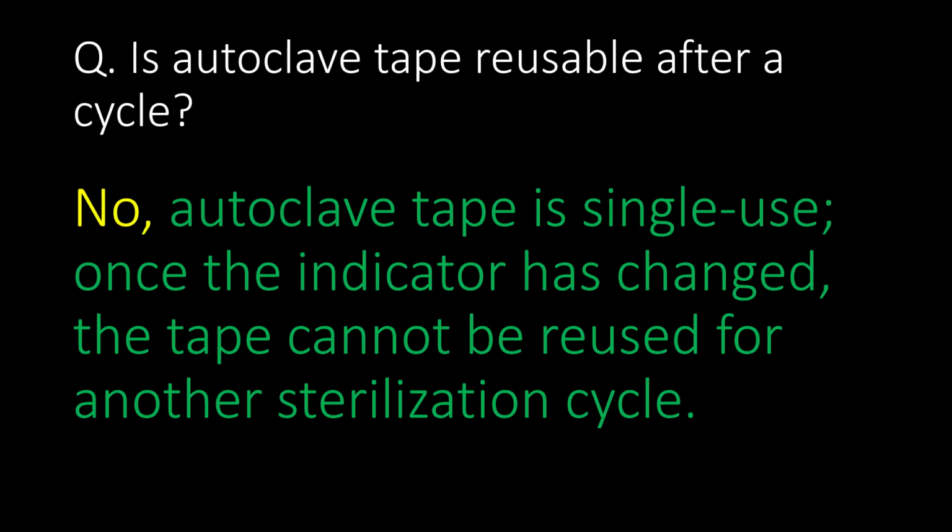Very frequently asked question, is autoclave tape reusable after a cycle? Direct answer is no. Autoclave tape is single use. Once the indicator has changed, the tape cannot be reused for another sterilization cycle.